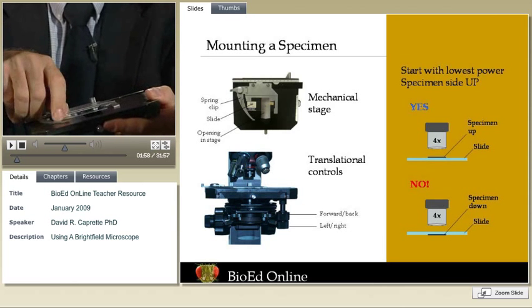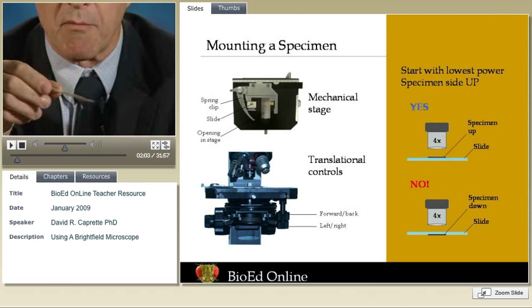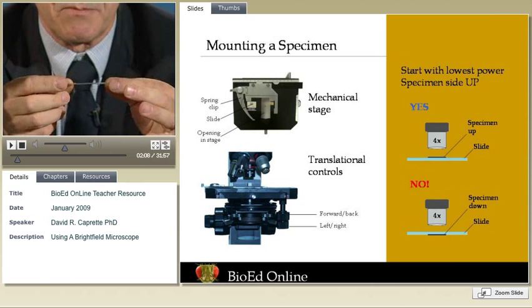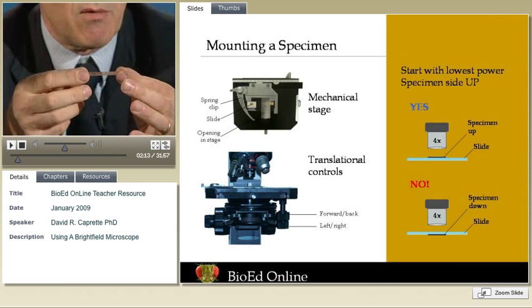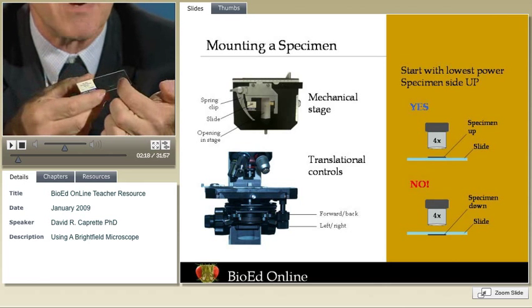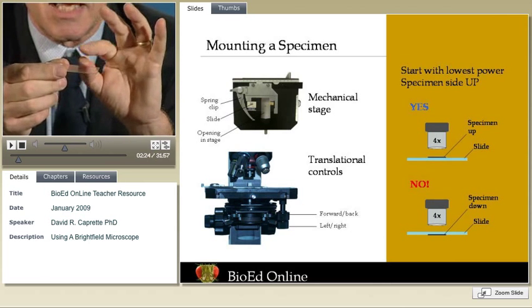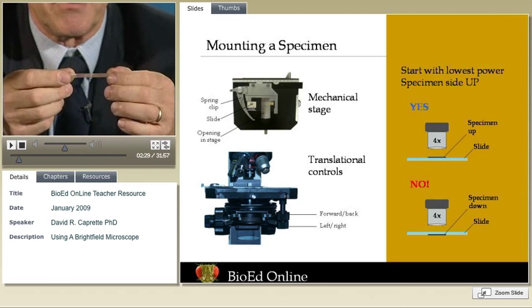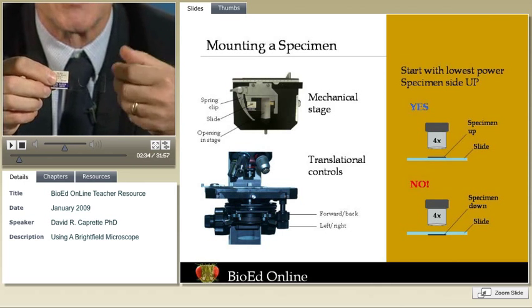The reason slides are thick is for mechanical strength — they've got to hold up. Cover slips are extremely thin and sharp and kind of dangerous. We put the specimen on the top of a slide because when we work our way up to higher magnifications, the objective lens has to get very, very close to the specimen. It almost touches the specimen. The focal distance is very, very close, particularly with an oil immersion lens. Sometimes we'll work with slides that don't have a label or even a cover slip — blood smears, for example.